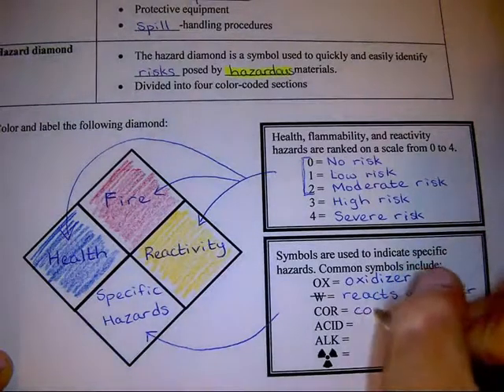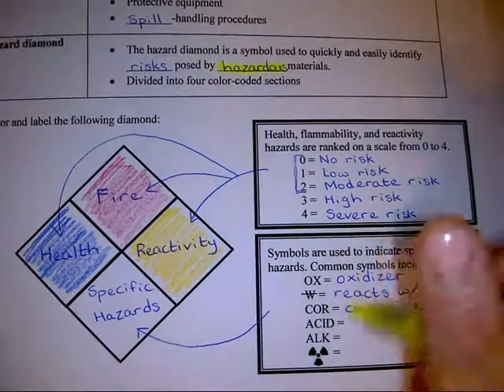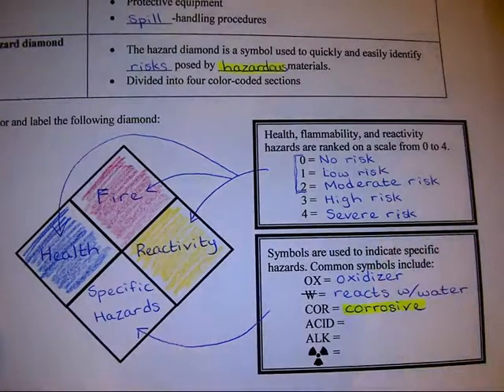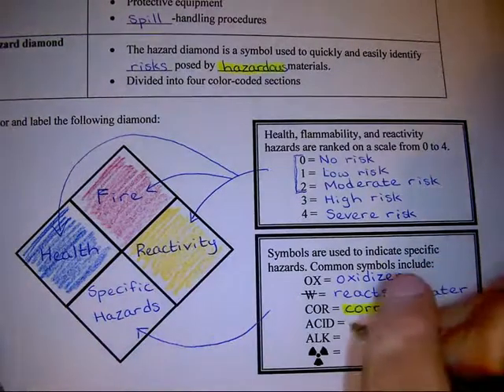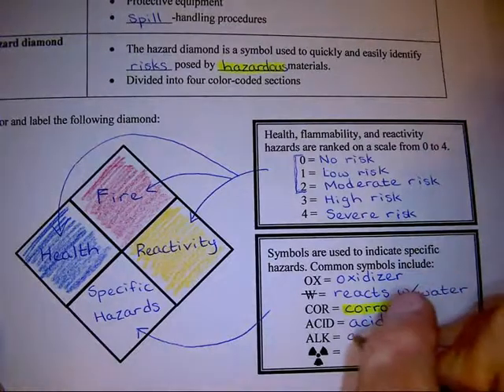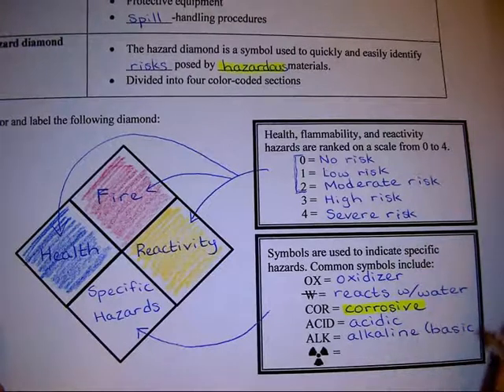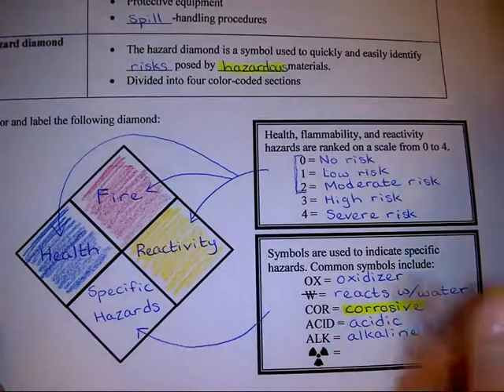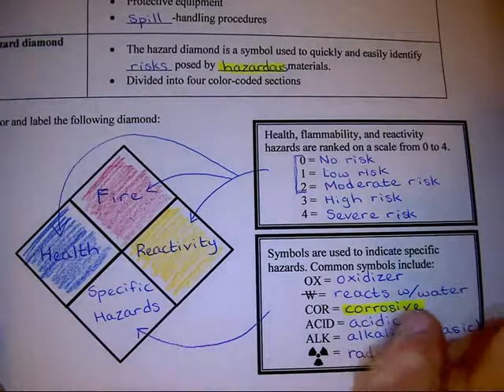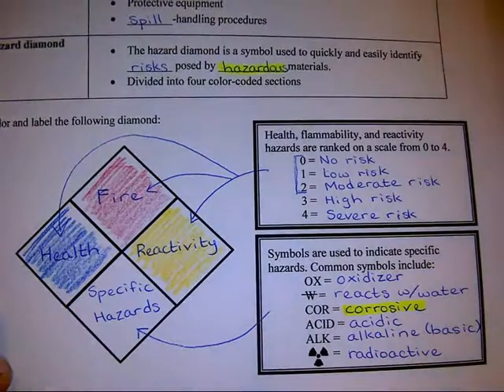COR stands for corrosive. I'm going to highlight this word because it is a pretty important vocabulary word. Corrosive means that it can eat away metal. ACID means it's acidic. Now ALK stands for alkaline, which is the opposite of acidic, or basic. And this symbol stands for radioactive. So these are some of the more common symbols that you might see on a hazard diamond.